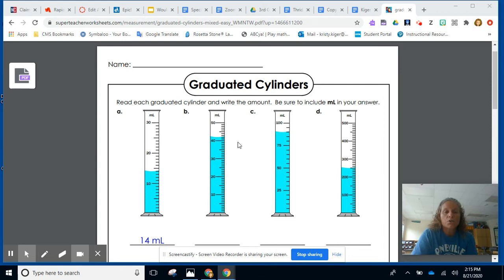If you take a look right here, I'm going to see if I can write instead of point. If you look here, it always starts at zero at the bottom. Then you see here it has 10, 20, 30. So we know in between all of those, those numbers are counting by 10. So we have to look and see then what are the little numbers counting by. So if I guess that they are counting by ones, I could count it out and check.